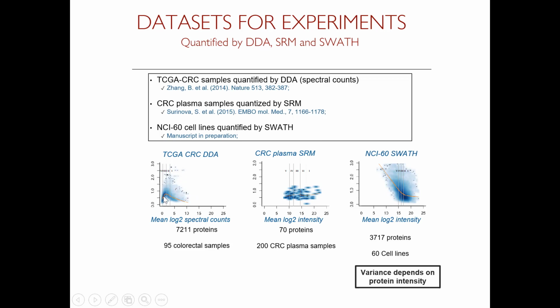It goes up, but then goes down, and we think this is statistical error because then you're basically in the stochastic domain. This was done by spectral counting, where you counted how many times a peptide is detected in the data set, and you can have either 0, 1, or 2, so this is no longer an accurate quantification. It's basically a stochastic event.